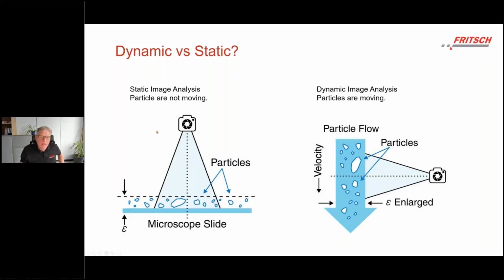And typically then the camera, or also sometimes the table, depending on the system, is scanning across a wider range of this sample. But nevertheless, the number of particles that you can detect with this kind of instrument is very, very limited.